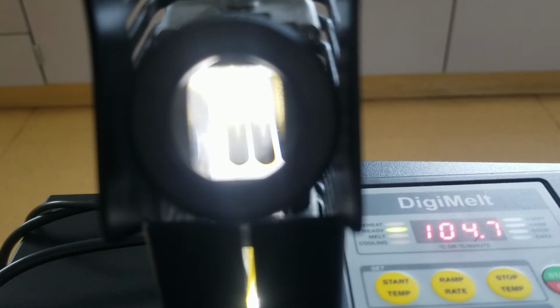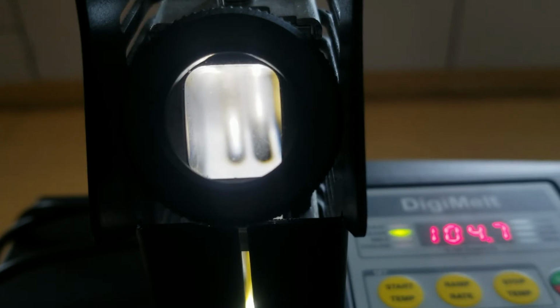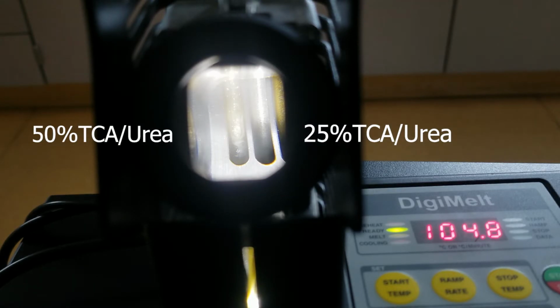All right, we're ready to go for the next one. For this one, we're going to go ahead and do the 50-50 TCA urea on the left. Toss that in there. We'll get some focus going on. Hopefully you guys can see it okay. That's better. So once again, that was the 50-50. And then the next one here is the 25% TCA going on the right.